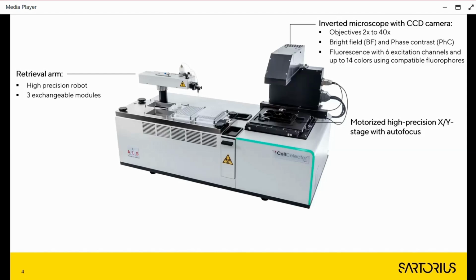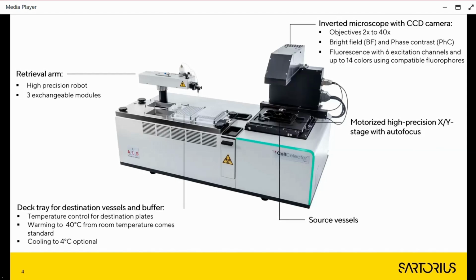Once the cells have been moved to destination plate, this plate can be heated or cooled based on the needs. For example, for omics experiments, sample cooling during extraction is crucial, as keeping DNA, RNA, and protein cooled ensures better stability of these structures.